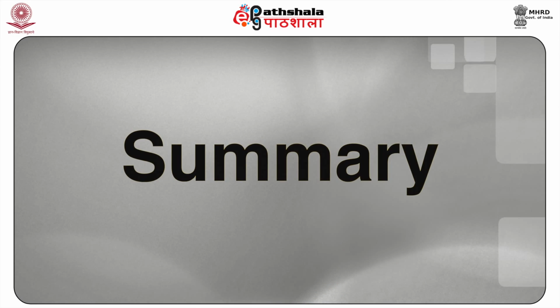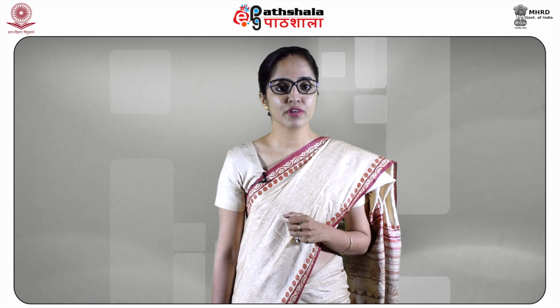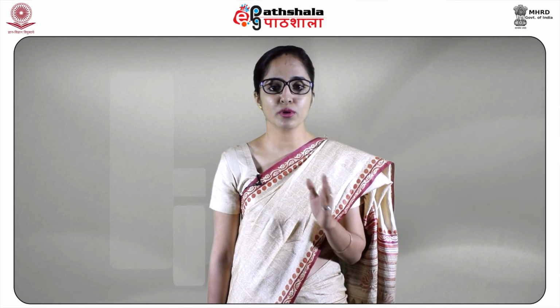Now, summarizing this module, students, let us see what we have learned. We have come to appreciate a lot of uses of UV visible spectroscopy: how substituents affect the absorption pattern in benzene and other mono or di-substituted benzenes; different applications of UV spectroscopy to qualitatively and quantitatively determine the concentrations of various compounds present in a mixture or solely present as a compound; and studying the thermal denaturation of DNA using the quantitative technique of UV visible spectroscopy.